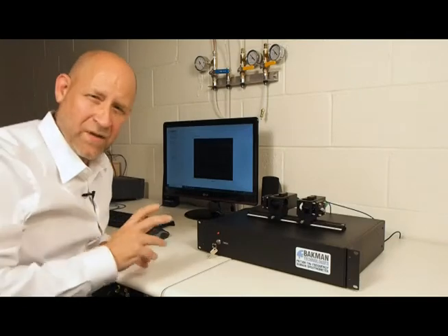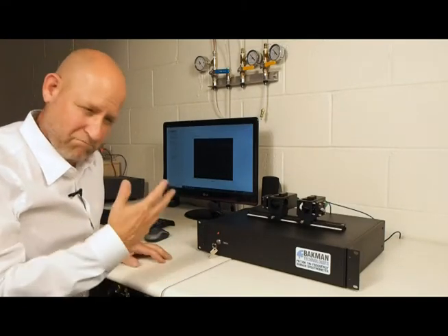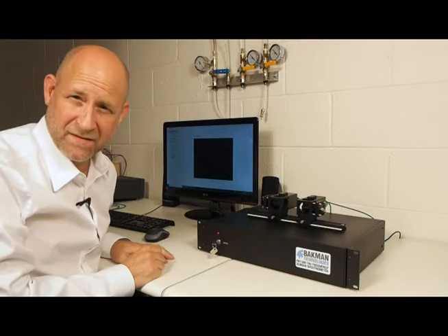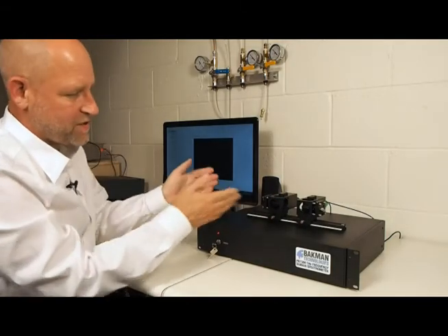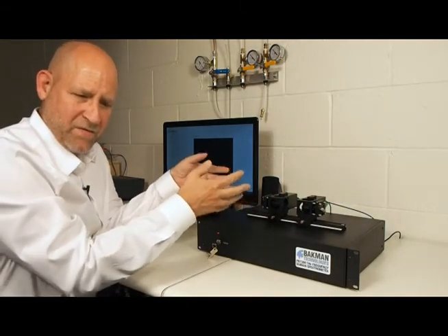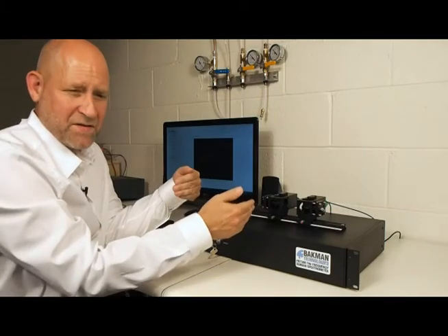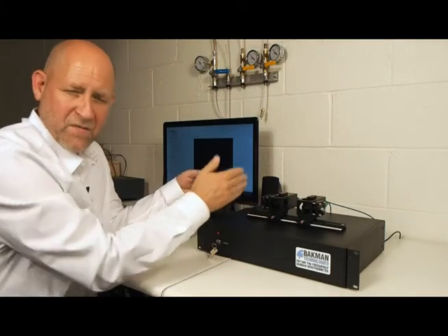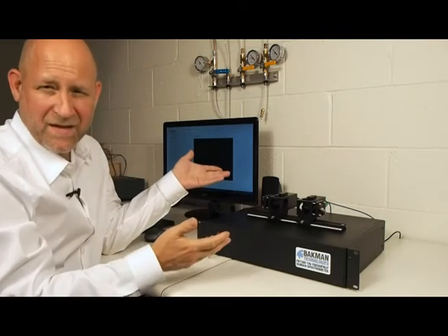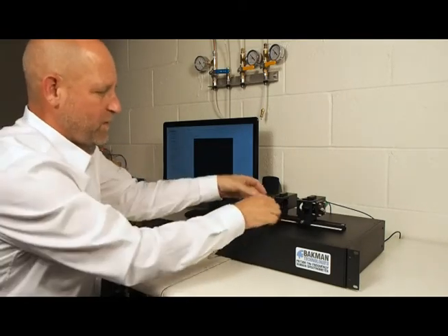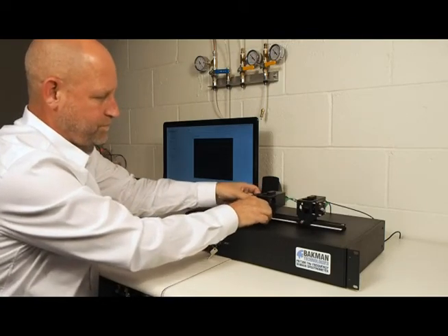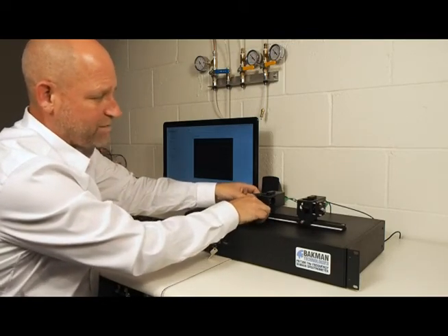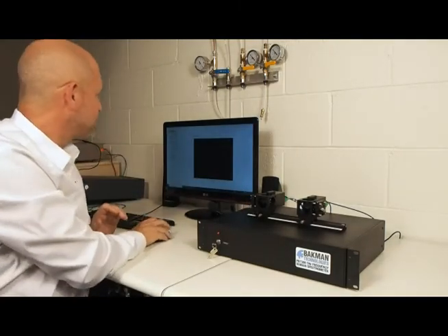One of the interesting features with the second harmonic that frankly surprised us how well it worked, is that if you adjust the heads, generally speaking with these frequency domain systems and the time domain systems, you have to balance the distance between your heads with the fiber lengths. And you get about a centimeter worth of give on that. But with the first and second harmonic detection, you can be off by 5, 6, 7 centimeters.